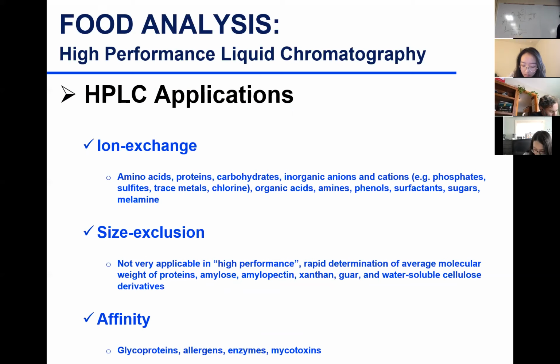Applications, again, for ion exchange: anything that can carry a charge. So anything that would potentially carry a charge, you can use ion exchange. Amino acids, definitely. Proteins, definitely. Carbohydrates, you would say, glucose doesn't carry a charge. No, it doesn't. Or lactose doesn't carry a charge. But do I use ion exchange? Yes, I make them carry a charge. So they are very weak acids.